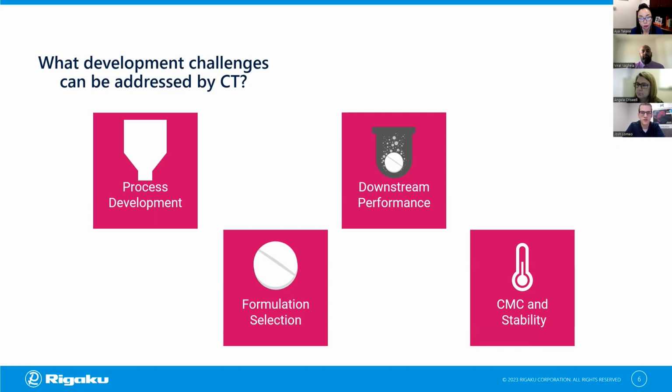And then the other component here is stability. Oftentimes, as part of ICH studies and regulatory submissions, pharmaceutical scientists will need to expose the drug product to high humidity, high temperature conditions, and evaluate how that affects performance. That is ultimately going to guide things like the packaging selection, the overall shelf life, and the expiration dates on the packaging. These are all things that the stability studies go into.